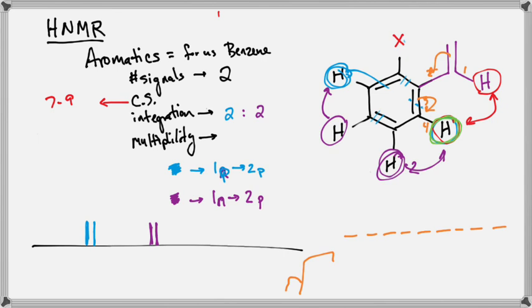That red split tends to be smaller than the purple split. Okay? How much smaller? So much smaller that on most instrumentation, you can't see the red split. It never actually resolves enough to split it. Okay? But if you get a strong enough magnet, right, you can start to resolve it and you can start to see it since you've got the packet.